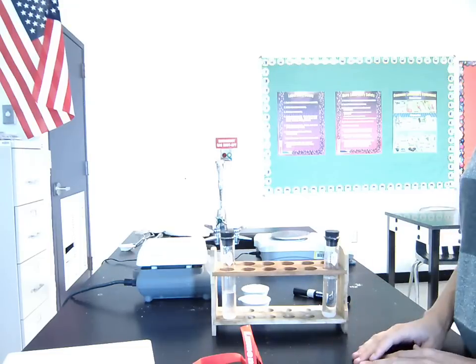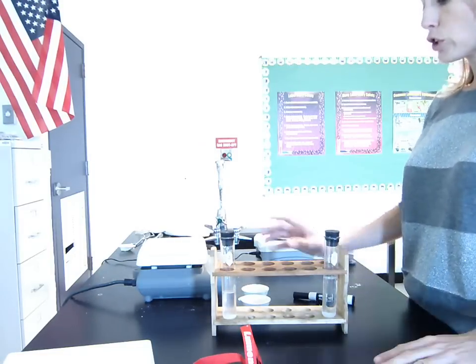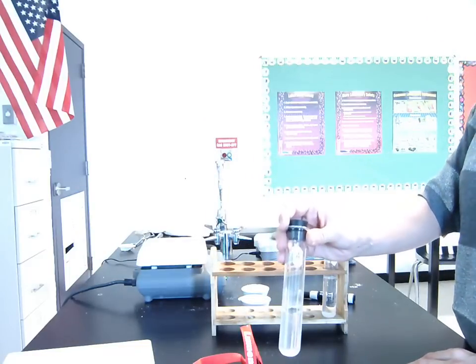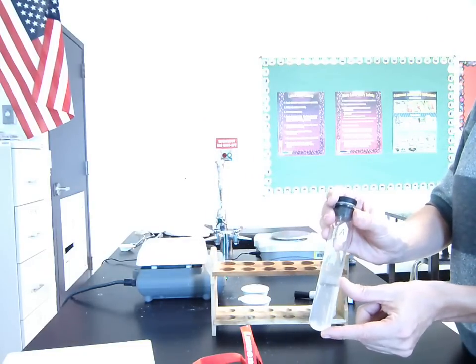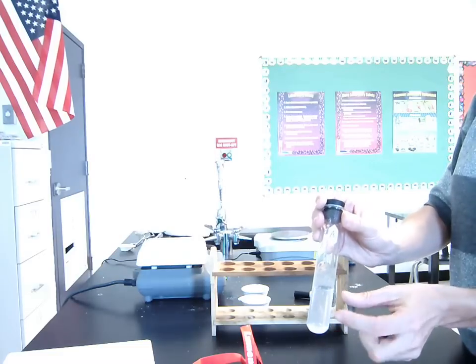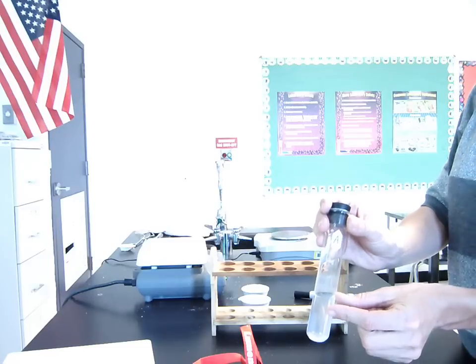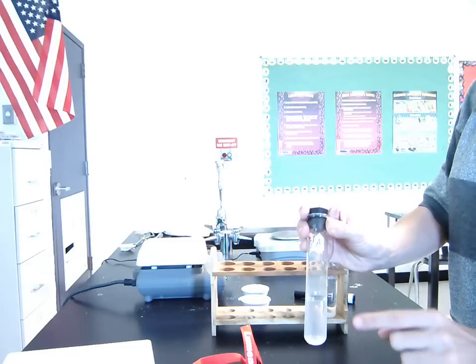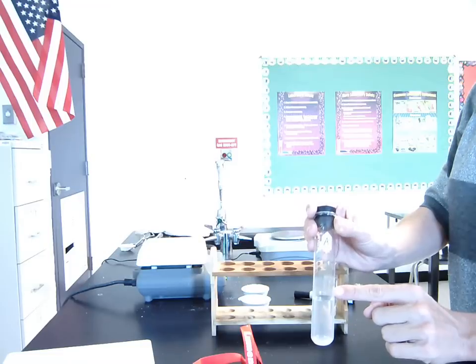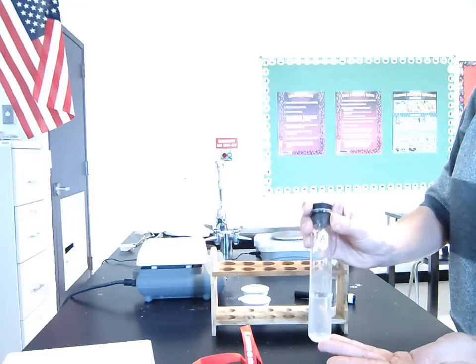All right, and as we go, I'm going to explain the process in steps. The first thing we're going to do is take a sample of the solution. Now, I don't need to use all of the total amount of solution. I'm just going to take a sample of it and analyze just a sample. And the reason I can do that is because what we learned in lab 4.1 is that when a solid dissolves in a liquid, it will evenly distribute itself throughout the entire solution.